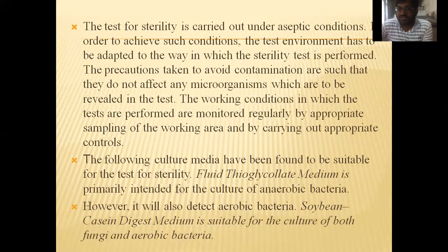The working conditions in which the tests are performed are monitored regularly by appropriate sampling of the working area and by carrying out appropriate control. The following culture media have been found to be suitable for this sterility test.